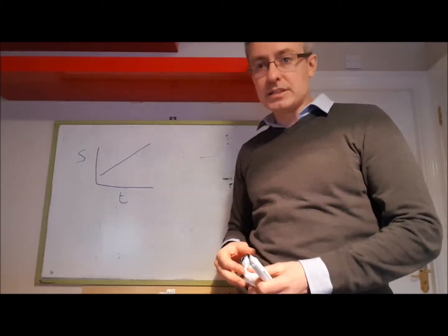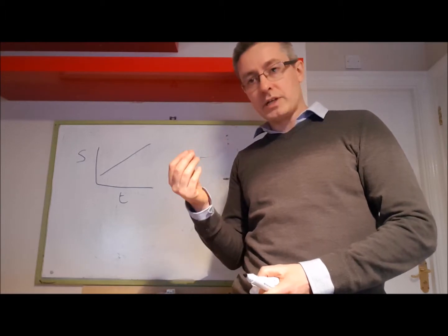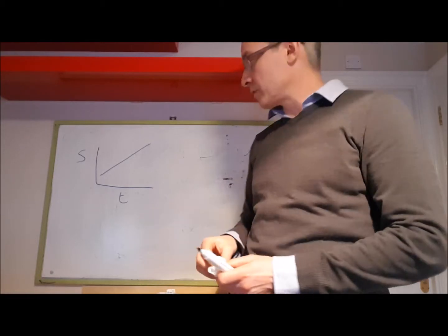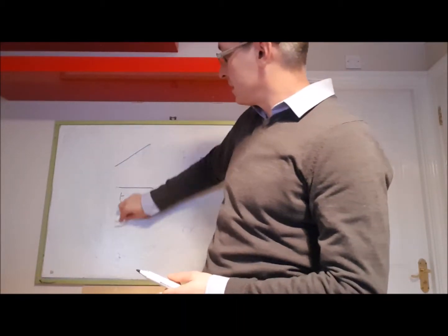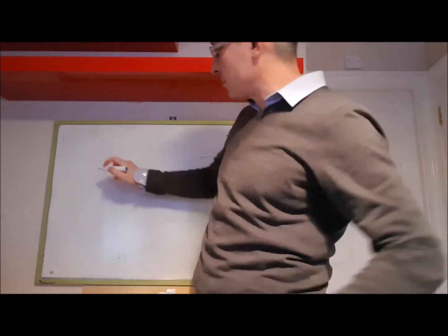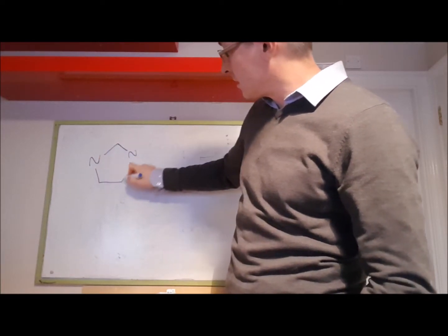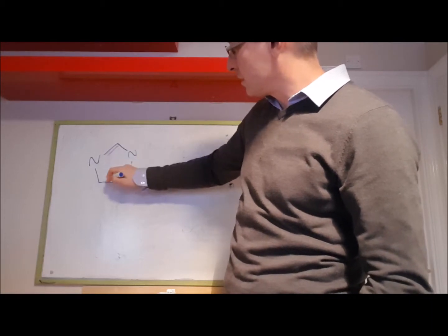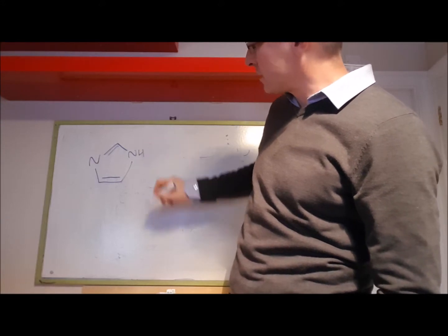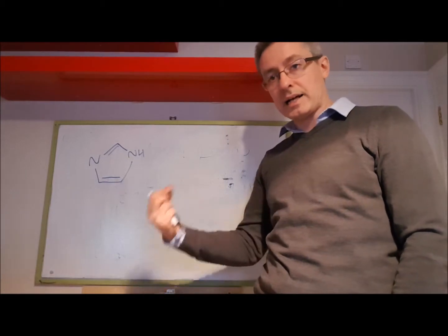Another idea is looking at the electrochemical, or looking at the molecules in that engine oil and characterizing those molecules as a function of time. Now I think they put some imidazoles sometimes, but I'm basically just trying to think of molecules that are sometimes in engine oils that are electrochemically active, and you get molecules like an imidazole, I believe, are added.